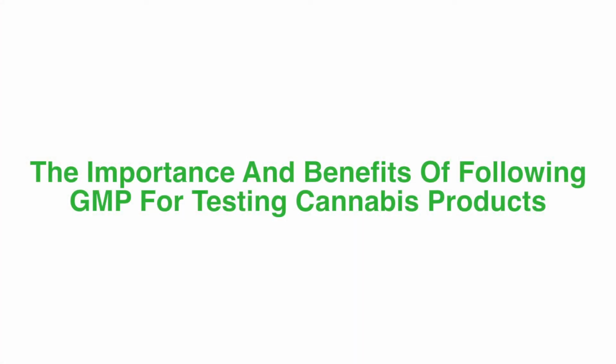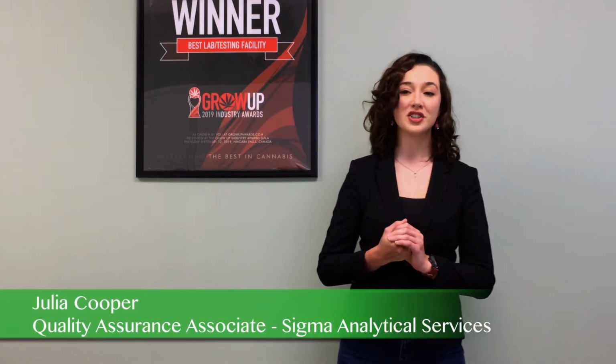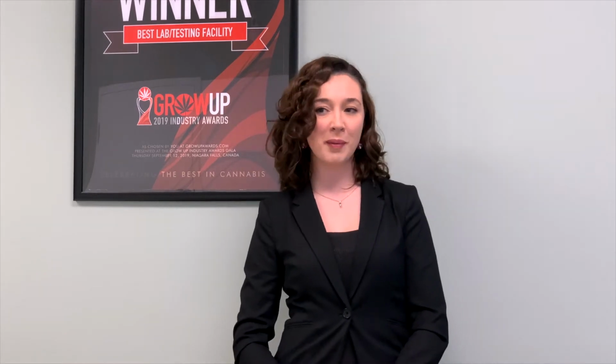Welcome! Today, my colleagues and I at Sigma Analytical Services are going to discuss the importance and benefits of following GMP for testing cannabis products. Good manufacturing practice, GMP, is defined as the part of quality assurance which ensures that products are consistently produced and controlled to the quality standards appropriate for their intended use. It is a collection of procedures, standards, and practices to be implemented as part of an effective quality assurance system.